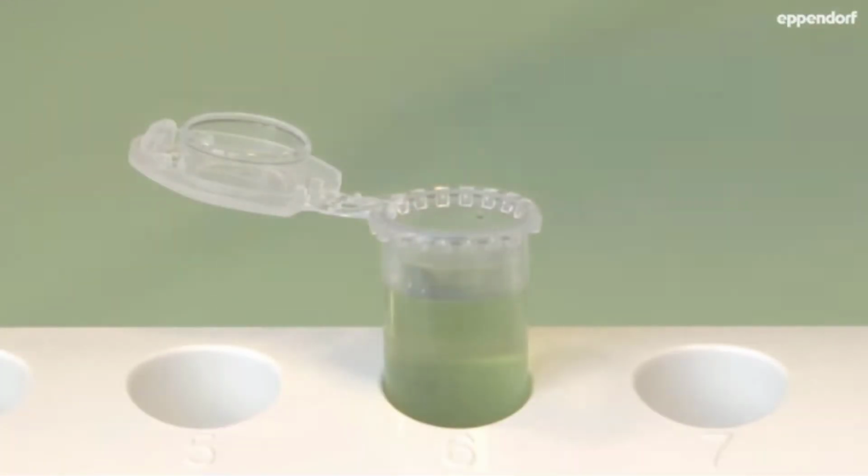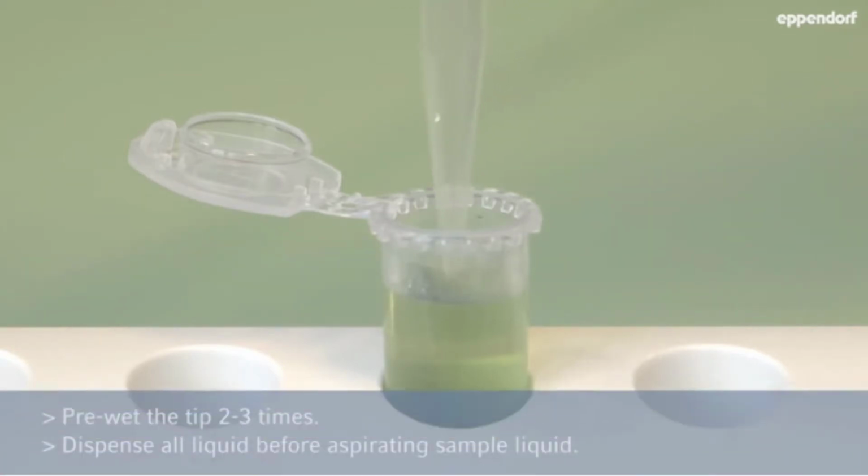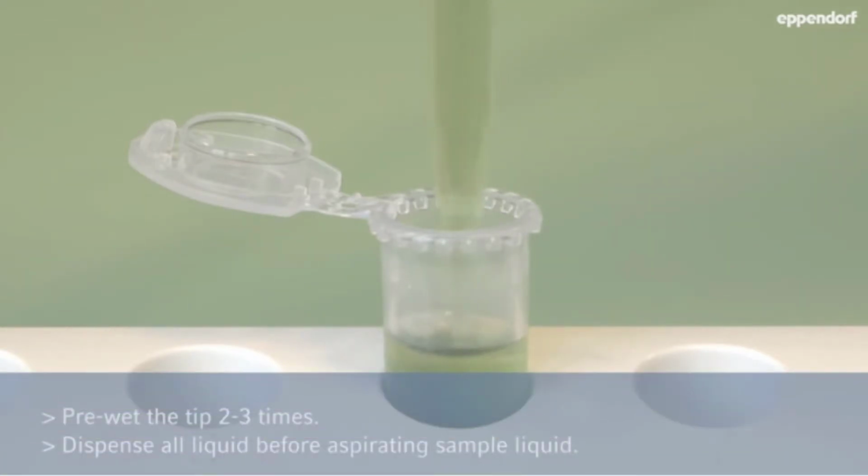Once the aspiration angle and immersion depth have been checked, slowly release the control button. Press the control button down to the first stop again and aspirate once more. Repeat this 2 to 3 times to saturate the air in the tip.